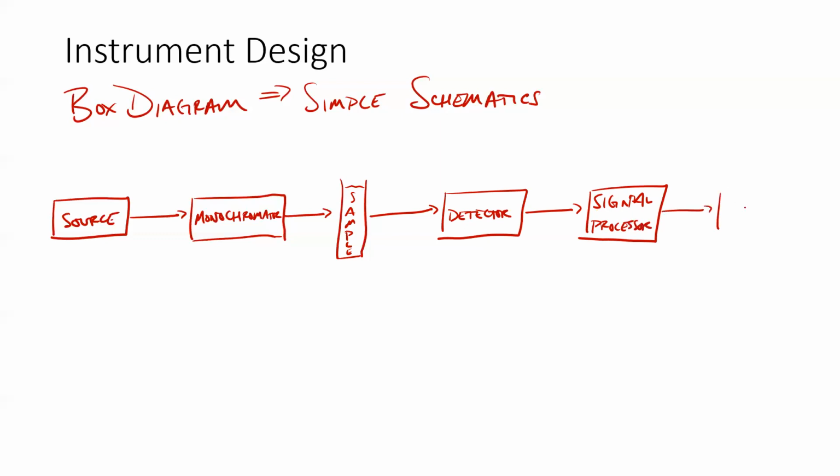And then the instrument tells us what the value is, so there's some kind of readout, whether that's a computer screen or a little LED display that gives us absorbance, whatever. I've told you already, I'm interested in the nuts and bolts of things more so than the electronic side, so we won't talk a whole lot about these two. We'll stick with the earlier part of the instrument.